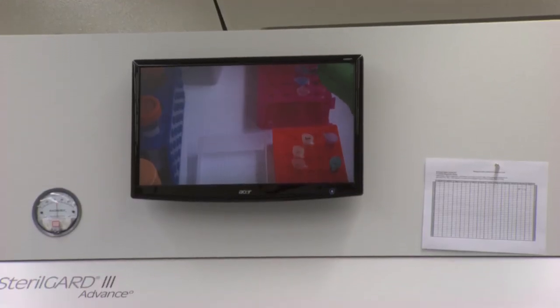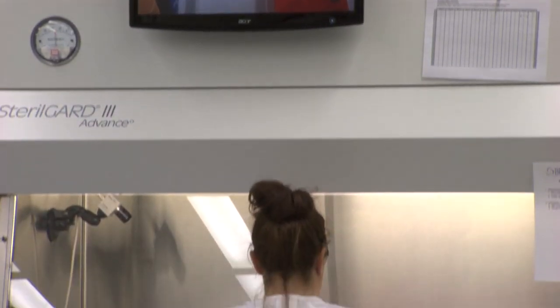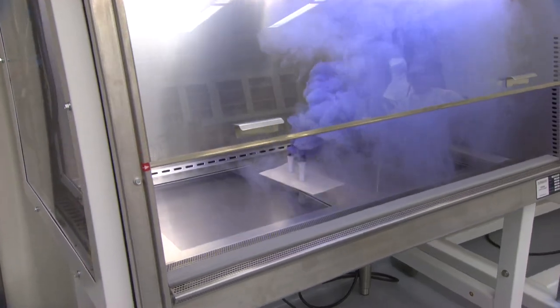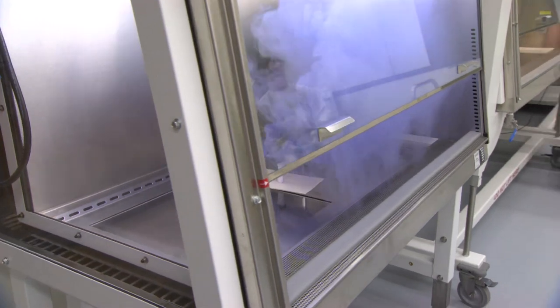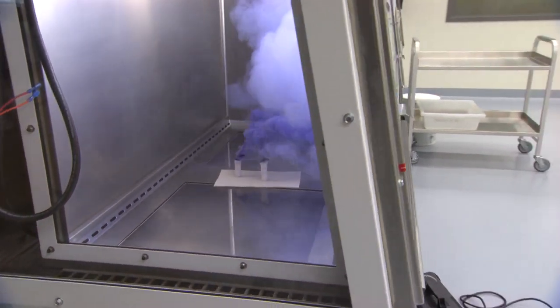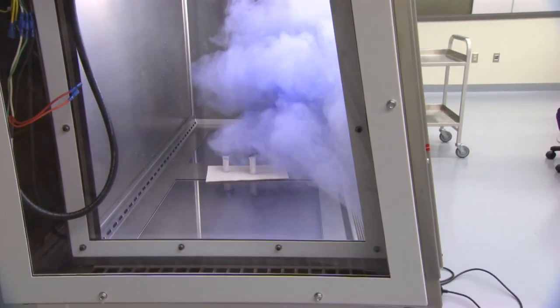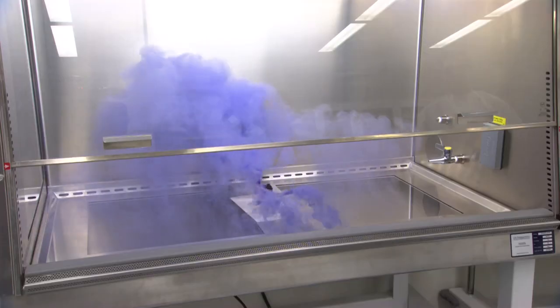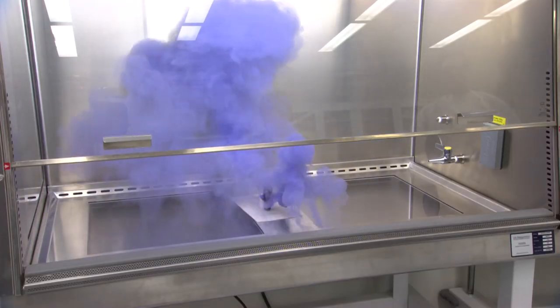The biosafety cabinet is the key piece of safety equipment in a biosafety level three laboratory, and it's in some ways kind of a lab within a lab. It also uses HEPA filtration and directional airflow to keep microorganisms or other particulates of that size inside the work area and not out into the laboratory.